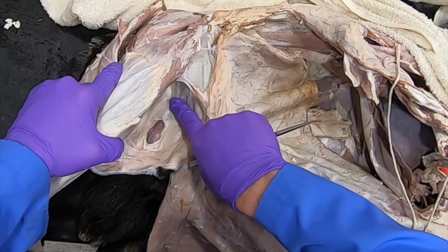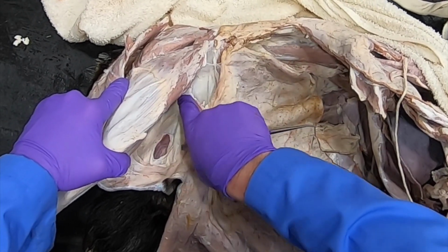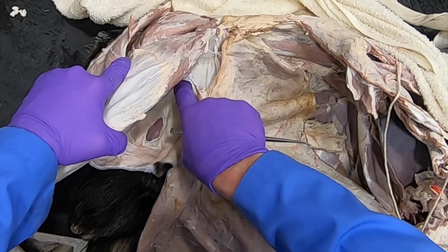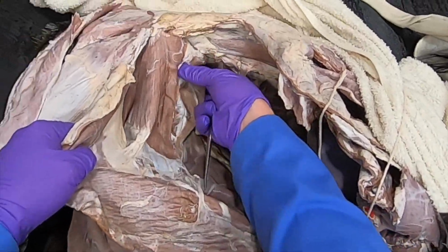If we follow that aponeurosis of the external abdominal oblique back up in here, and we find its caudal border right there, that's going to be the inguinal ligament. Okay, now let's open up the abdomen this way.